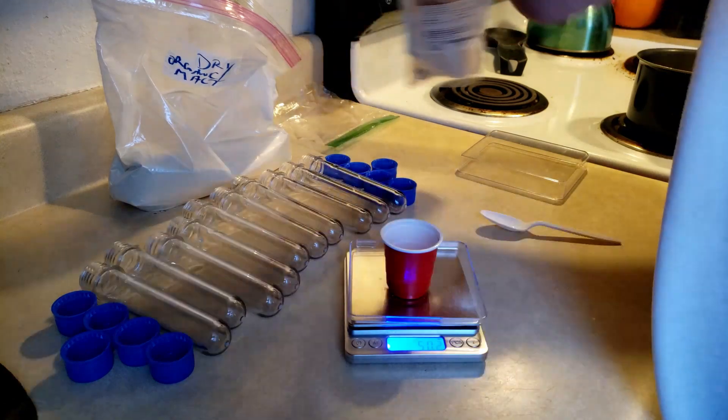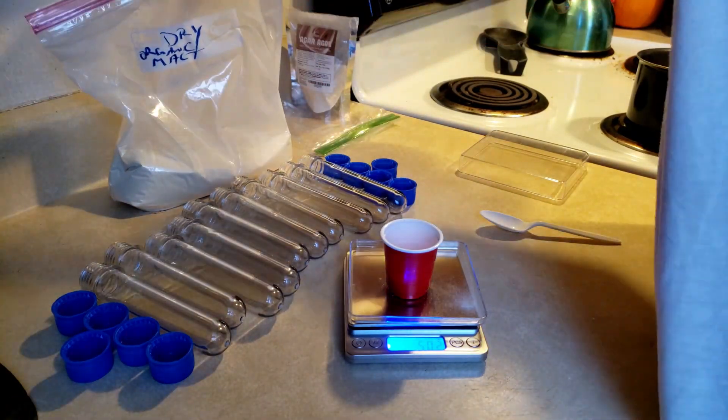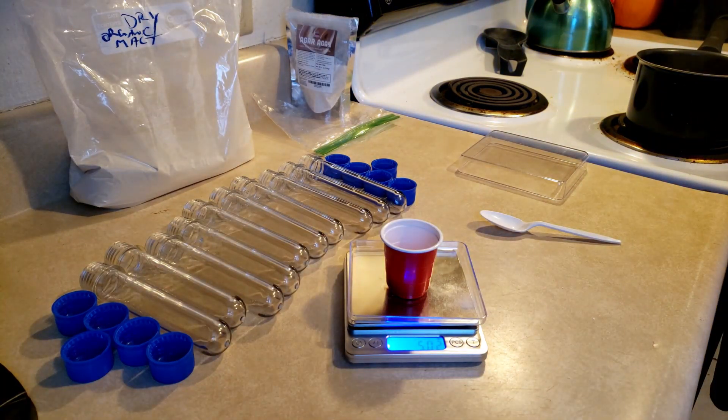So we have a total of 5 grams of agar and malt mixture. It's ready to go into our 100 milliliters of water, but we're going to have to pause on that for just a minute until our sticks get done boiling.